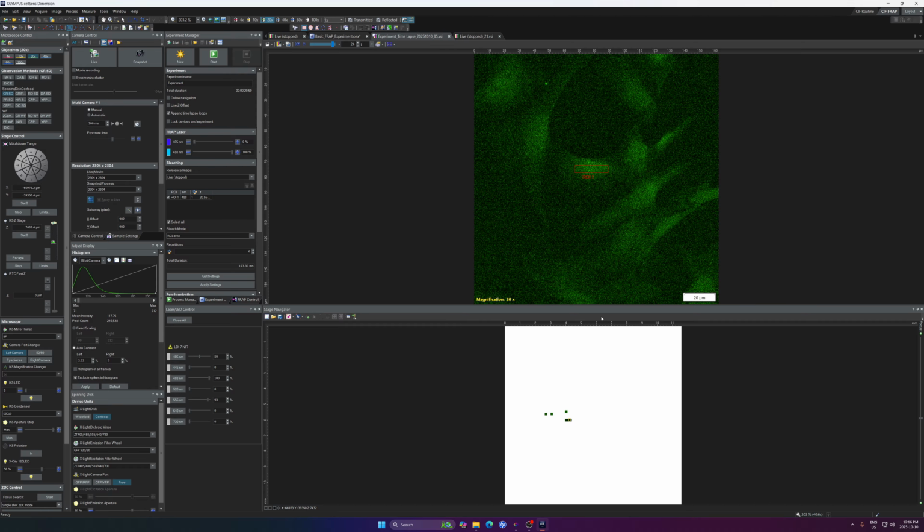So that's about FRAP, and for microirradiation, basically you use a different laser beam, which you can change through this very obscure way. And that will be microirradiation. You can give an amount of laser power and how many iterations you do, and perform exactly the same experiment.